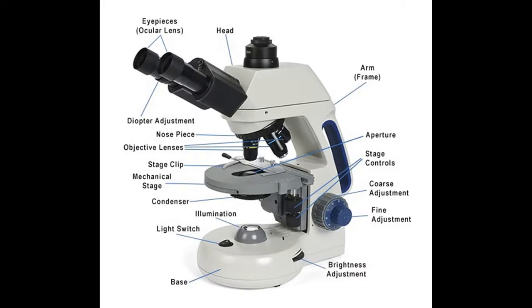So microscopes are basically instruments that are used for visualizing microscopic objects or anything which cannot be seen with an unaided eye. Microscope is used for visualization of such objects. Microscopes come in different types, and different classification schemes are used for categorizing the types of microscopes.